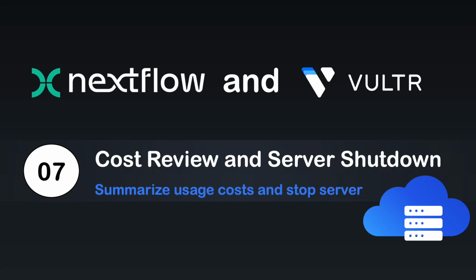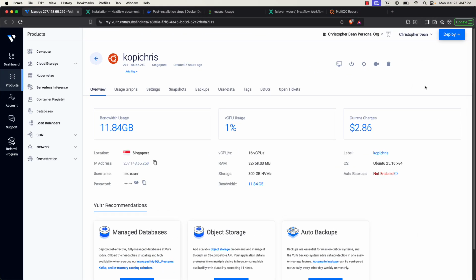Hey everyone, welcome back. In this video, we're going to take a look at the total cost of running our bioinformatic analysis on the cloud and learn how to shut down our server so we don't continue getting charged. Let's get started.